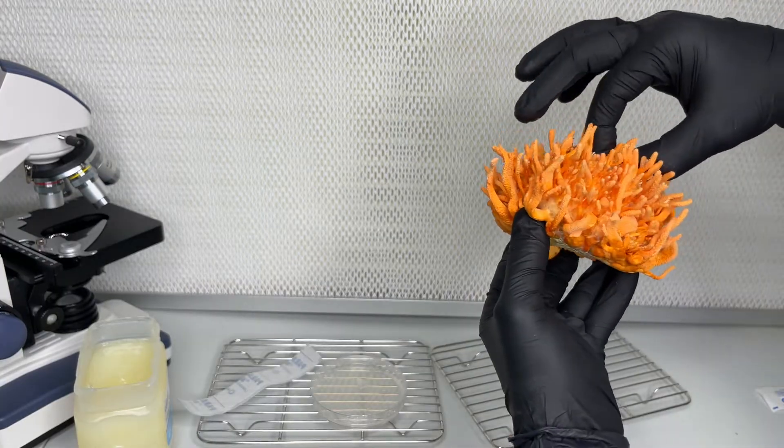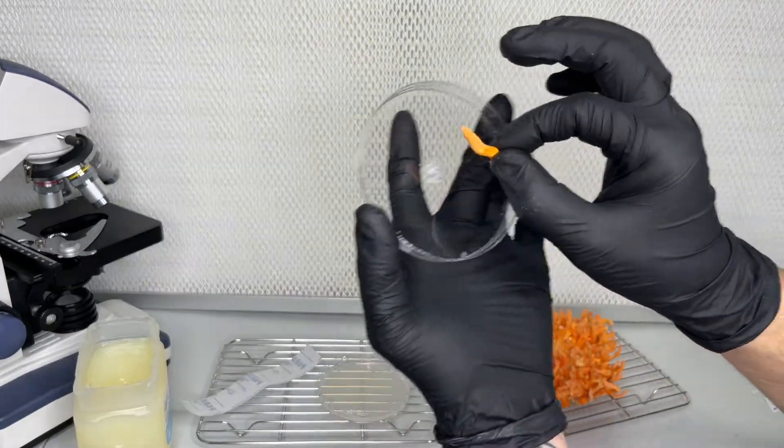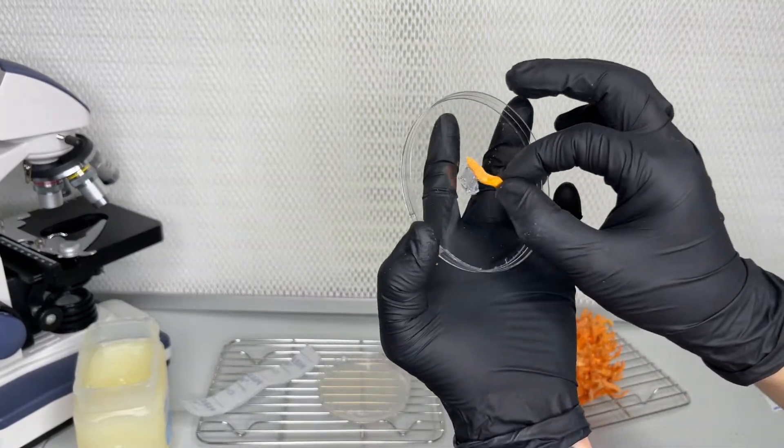After sticking the Cordyceps to the top of the agar plate, it is sealed with parafilm and allowed to incubate at 70 degrees Fahrenheit for two weeks.